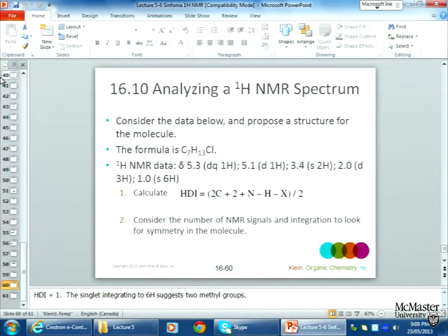Above 5 must be sp2. So we've got 2 separate hydrogens on sp2 hybridized carbons. So there's a fragment that gives me that. Okay. So we're going to start piecing the fragments together in just a minute.